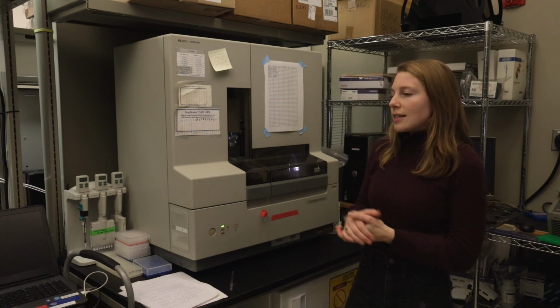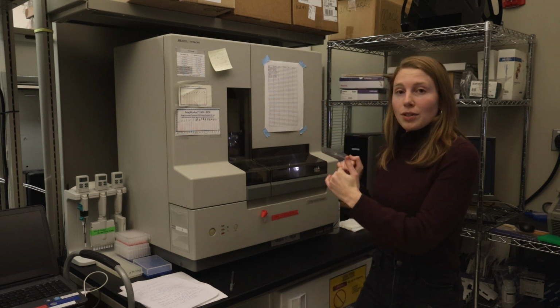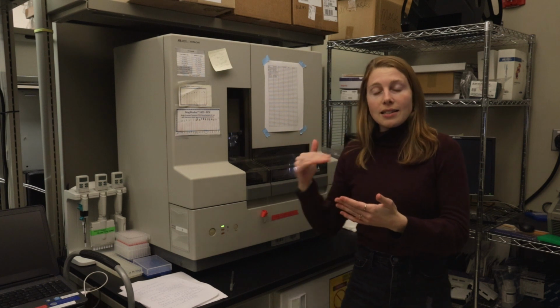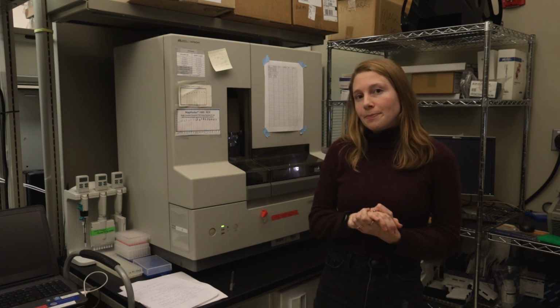And so what you get is lots of different fragments of different sizes. And so when you separate out those sizes, we can look to see what the order of the A's, the T's, the C's, and the G's are based on the color of the base at the end of the fragment.